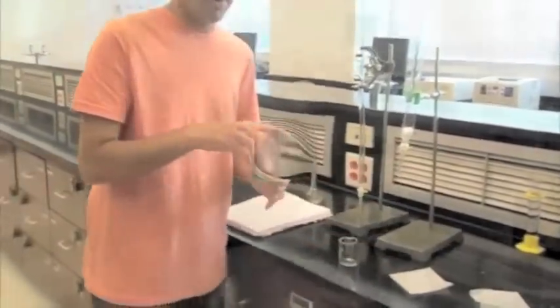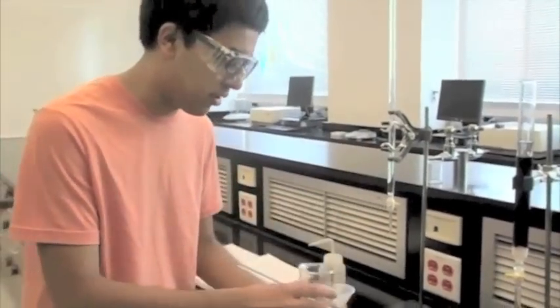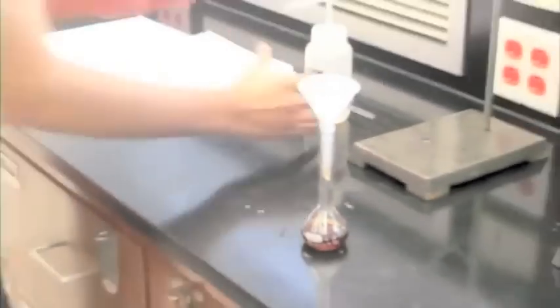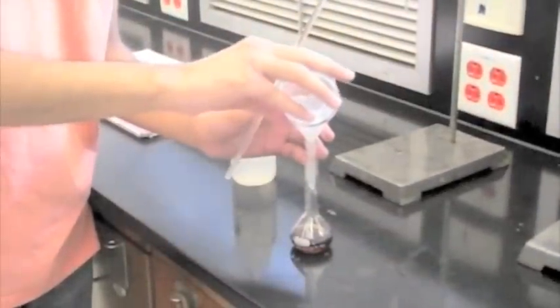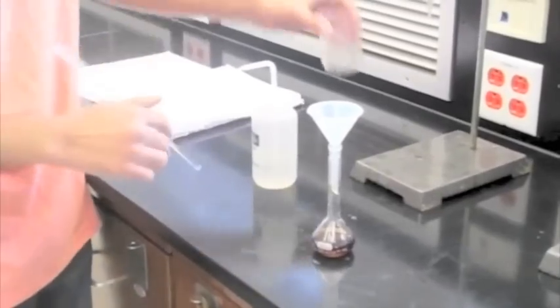Next, take a 50 milliliter volumetric flask with the funnel and pour in your solution, making sure the zinc powder does not get into the flask. Wash the leftover zinc in the beaker with deionized water and pour the liquid into the flask. Finally, add deionized water until the solution reaches the 50 milliliter mark.